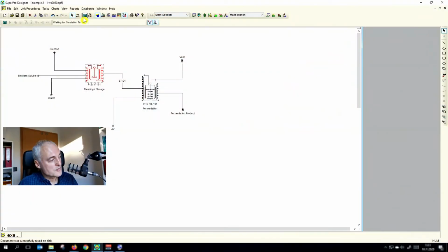Then we went to the blending tank, added the charge operations we previously had, initialized them with the correct stream and the mass, and the agitate was just the hour. And then we had the transfer out operation, which we initialized also with the correct stream. So that's it. And therefore, in principle, hopefully this works.